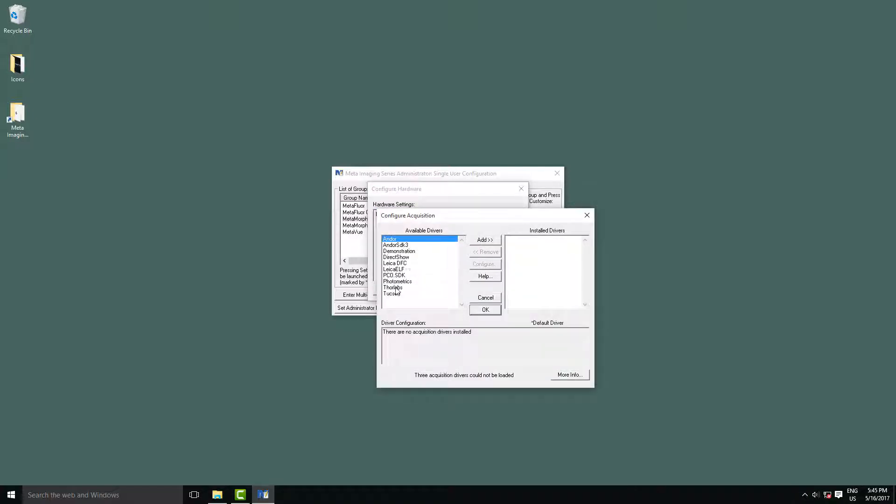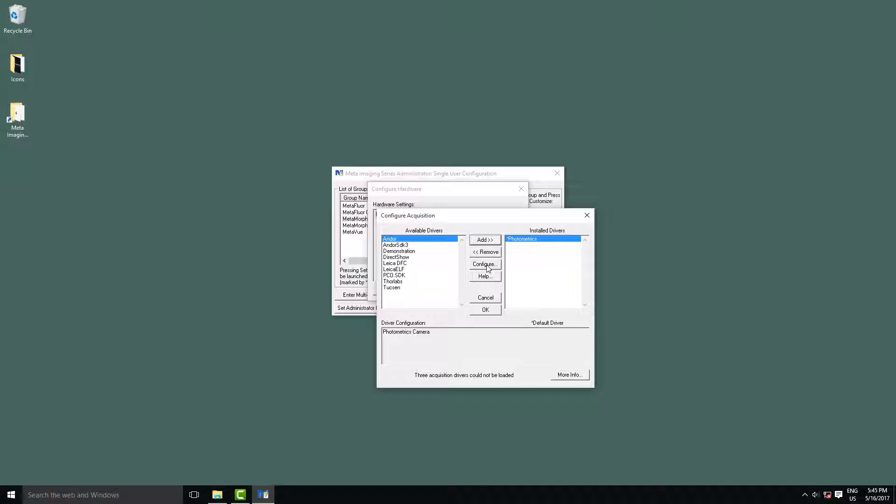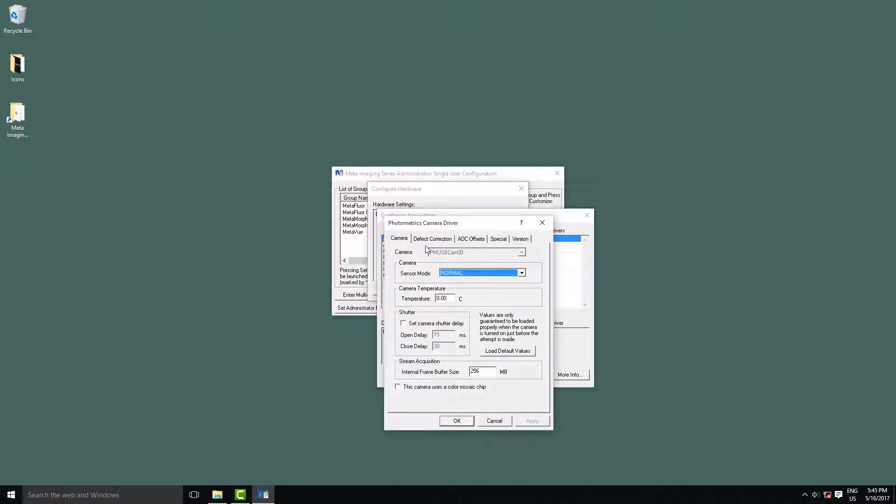Here we have a list of your available drivers that are installed. We want to select Photometrics and click Add. To briefly cover the configuration of the cameras, here we can see a list of the cameras that you have active and currently plugged in and turned on. Here we have one USB camera plugged in.